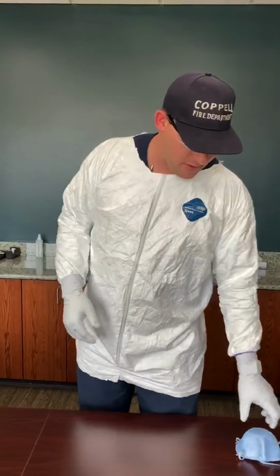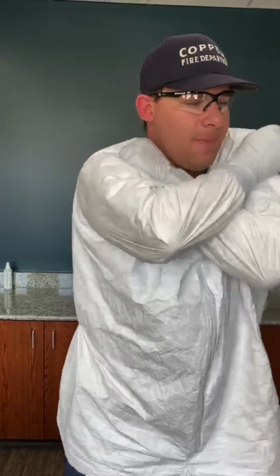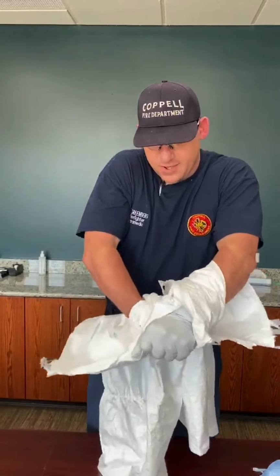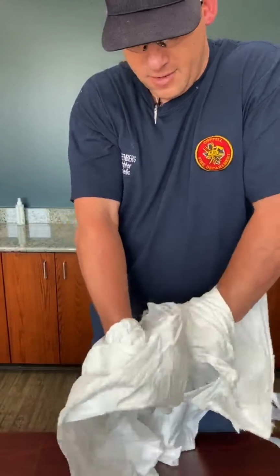So, all right, we're going to demonstrate after a transport. You get to the hospital, you need to doff your gown and your PPE. Obviously, I would have my mask on, but making this video, you wouldn't be able to hear me. First thing I do, I want to grab around the shoulders and break the collar on the way down. And I don't want to touch my skin with any of the outside of the gown or my gloves. So my gloves are going to go to the inside.